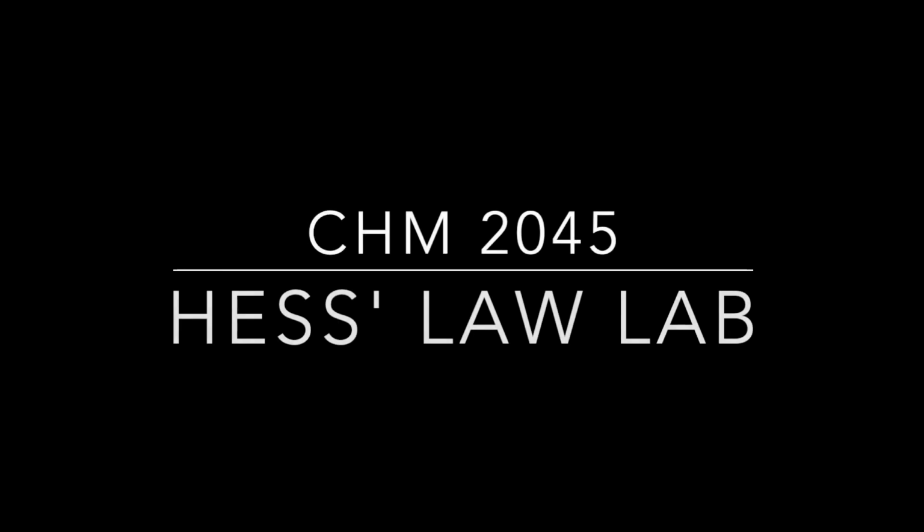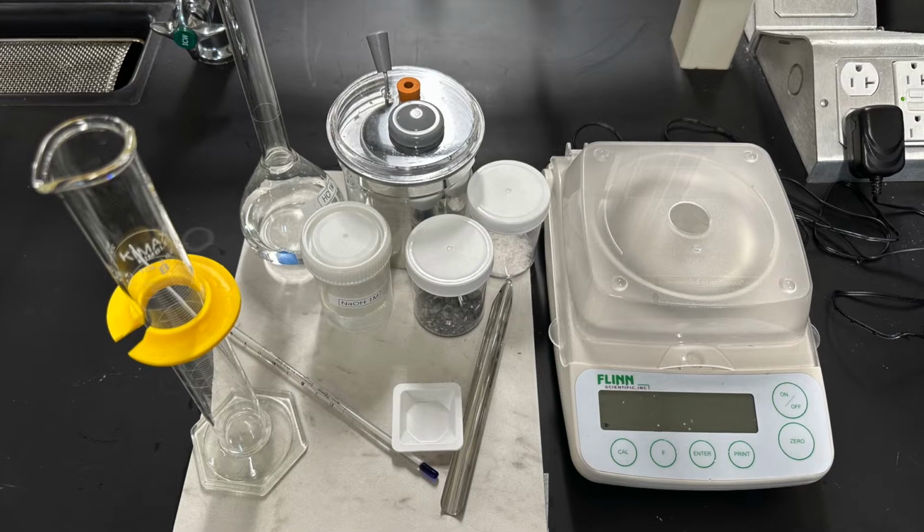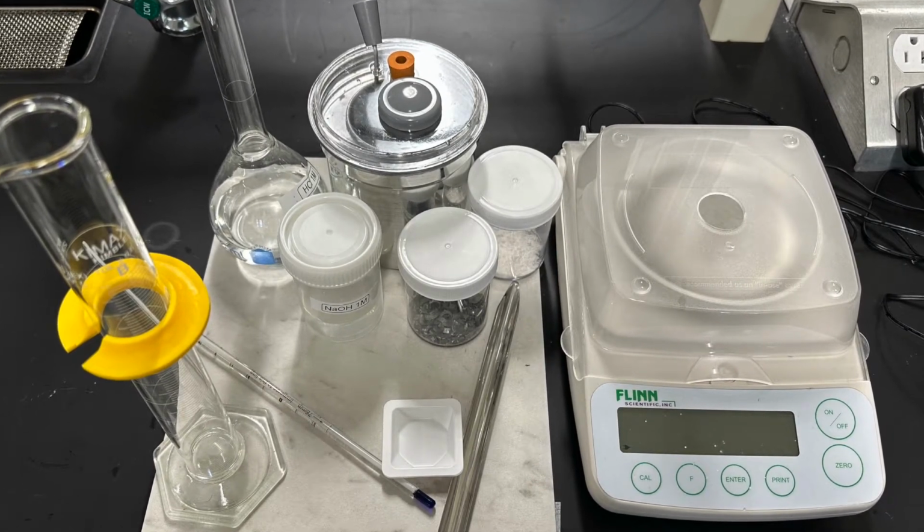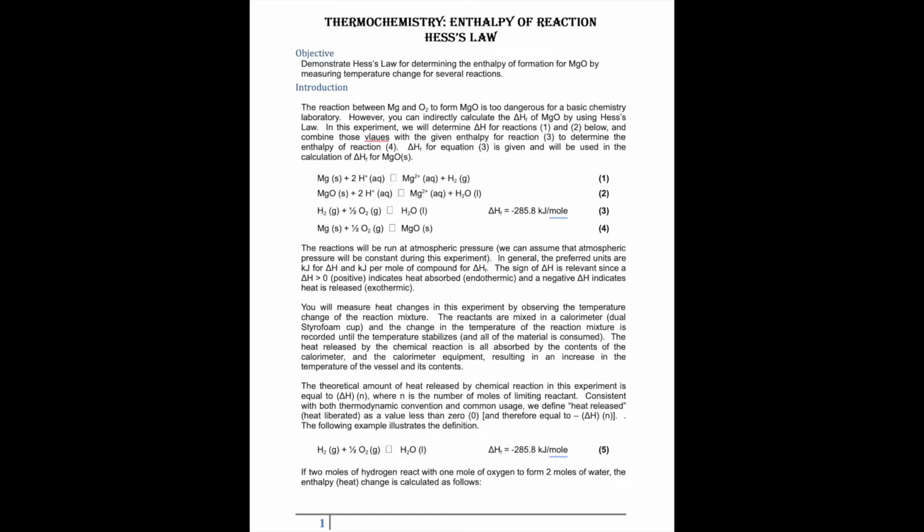Welcome to Chem 2045, Hess's Law Lab, or enthalpy of reaction law. In this lab, we're going to use 1 molarity hydrochloric acid, 1 molarity sodium hydroxide, magnesium, and magnesium oxide, as well as a calorimeter.